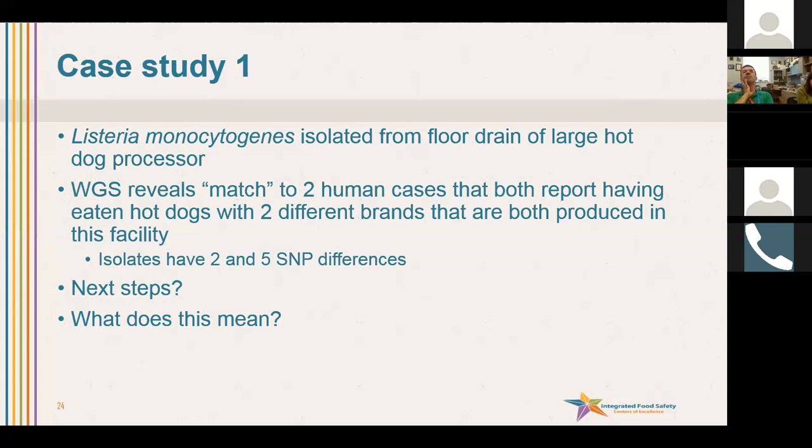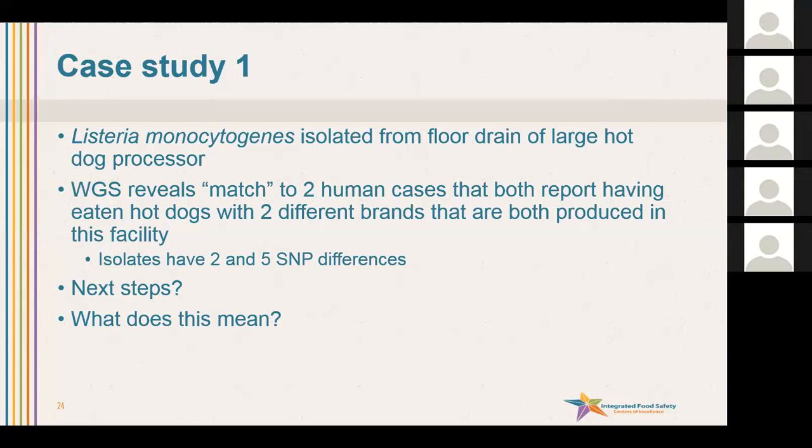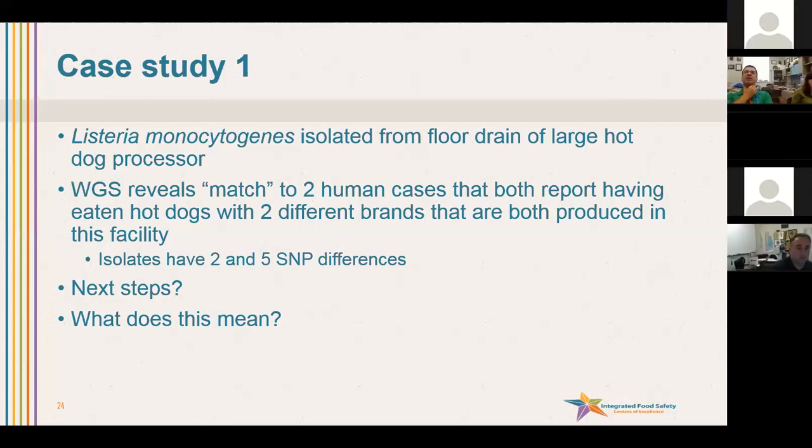Do some environmental sampling of the same equipment that may have been around at both of those times, or the locations of processing, if they were in the same areas both of those times for these products, to focus on those things in common. But definitely do an environmental assessment and do some sampling. Okay, so we would go out, do an assessment, but also collect some sponge samples from the environment in the hope of finding some more Listeria monocytogenes, which we then, of course, could also sequence and see if that same Listeria monocytogenes subtype is still in that facility.